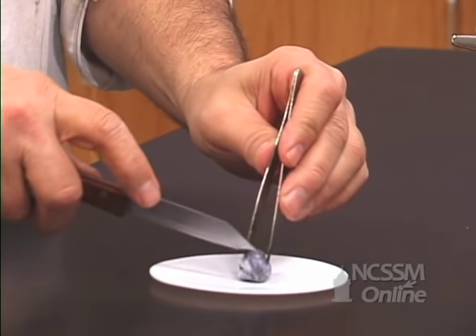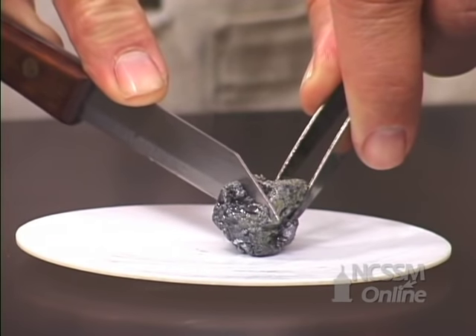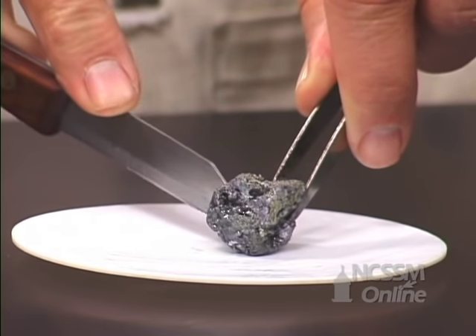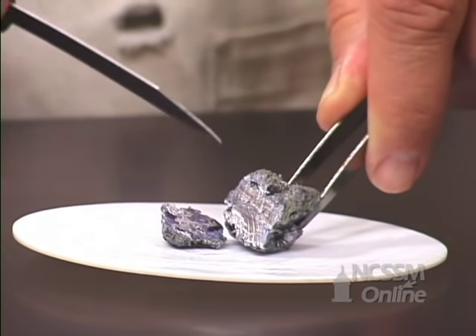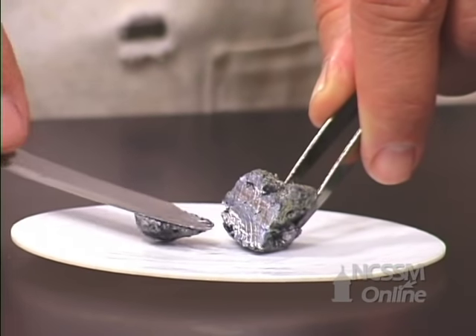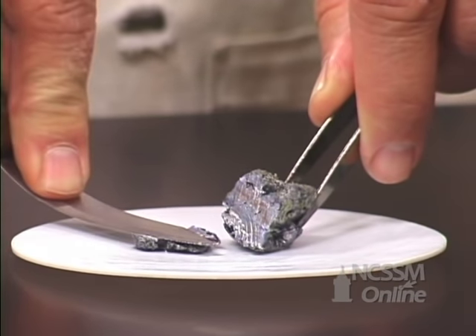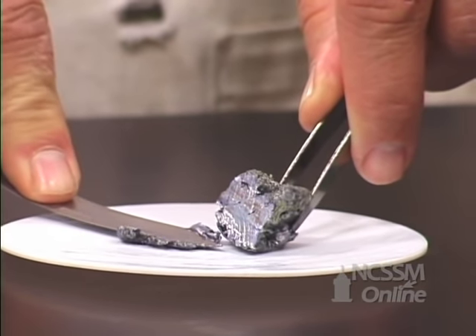The potassium cuts very easily. As we cut through the metal, we expose the shiny metal surface underneath. The potassium is extremely soft. We can easily flatten out the potassium metal. It has a consistency of cream cheese.